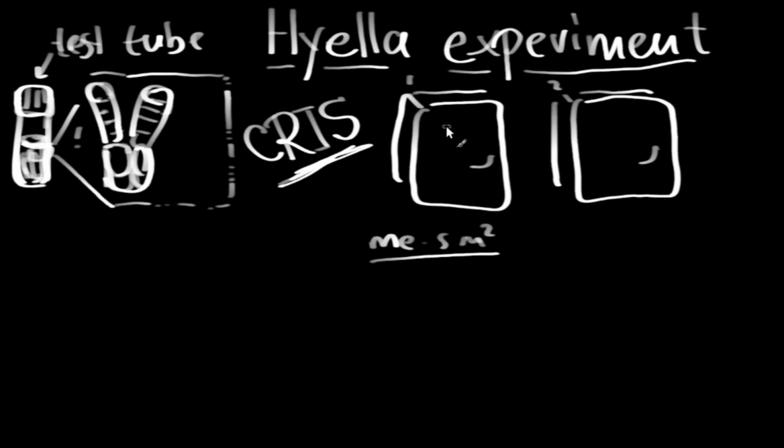And in the first incubator, it's actually not a fridge. It looks like a fridge, but it's an incubator. In fact, it has not so low temperature, it's like 25 or so. And in this refrigerator, we get light intensity equals 180 microeinsteins per second per square meter.